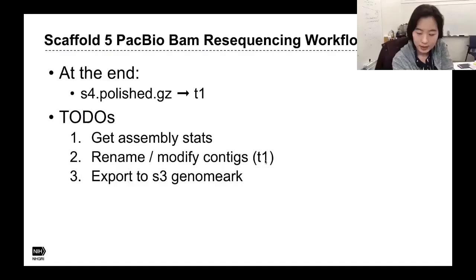Yeah, I think I like that option too. It's the high C option, which tolerates more alignments when aligning the CMAPs, I mean, between the CMAPs, which tolerates more errors basically for extending the mapping. I like that option too, and I think the VGP, at least those who are running the BioNano step locally, started to use that option.